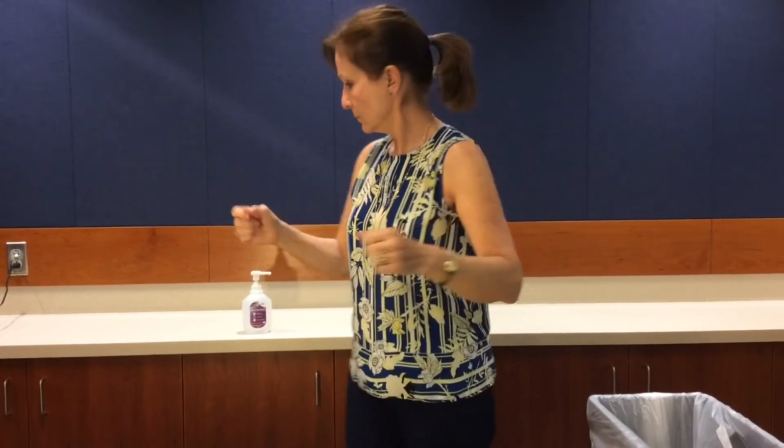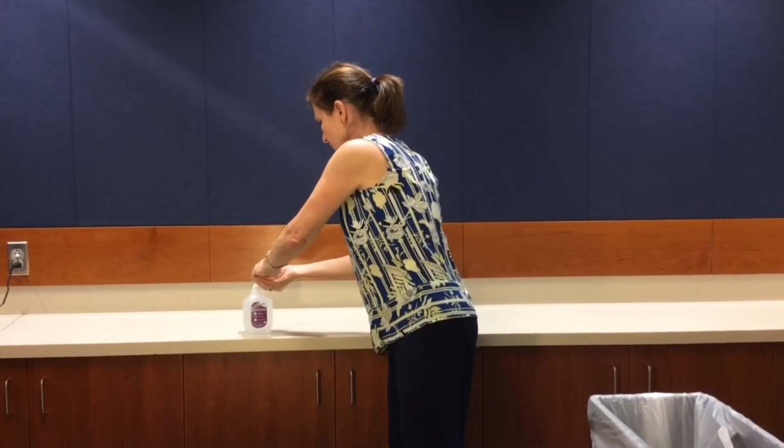The final important step is to perform hand hygiene with alcohol-based hand sanitizer after all PPE is removed and before you touch your face or clothing or any surfaces outside the patient room.